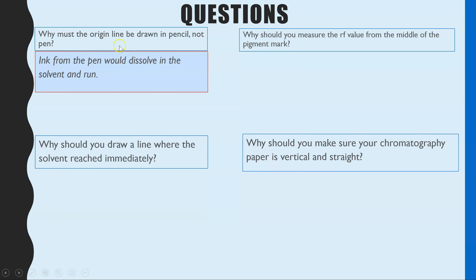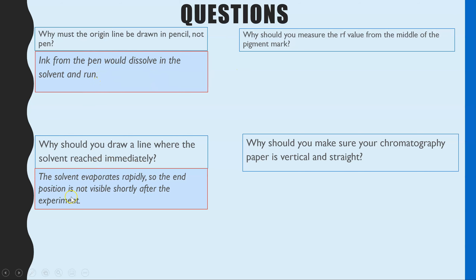The answers: number one — it has to be pencil marks on your chromatography or TLC paper because pens contain ink, and ink is a pigment. That ink would dissolve in the solvent, run up your chromatography paper, and interfere with your chromatogram. Number two — you draw a line where the solvent reached immediately after taking it out because the solvent evaporates very quickly, so the solvent front is not visible shortly after the experiment, and without that pencil line you won't be able to calculate your Rf values.